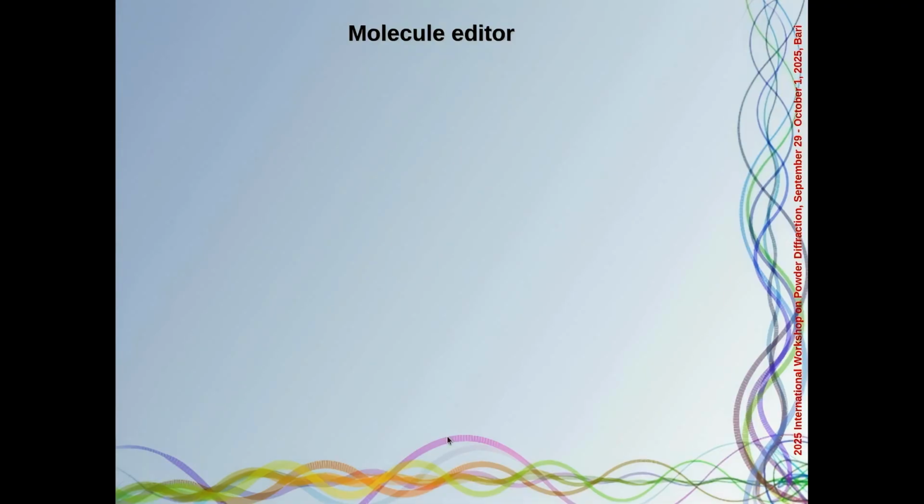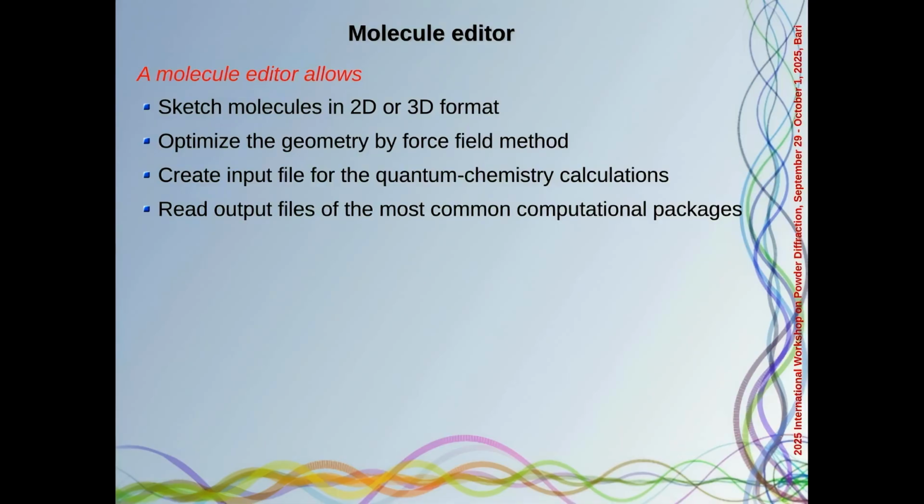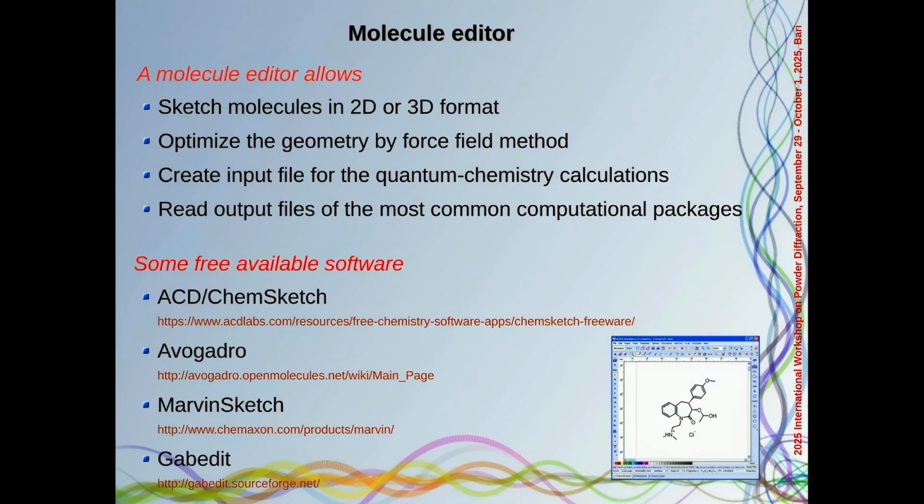And sometimes you need a molecular editor. A molecular editor is just a software, an external software that you can use to sketch molecules in 2D or 3D, to optimize the geometry by using force fields, to create the input file for quantum chemistry calculation, and to read the output file created by other computational packages. And this is not an exhaustive list, it's just a list of the software that I have tested.